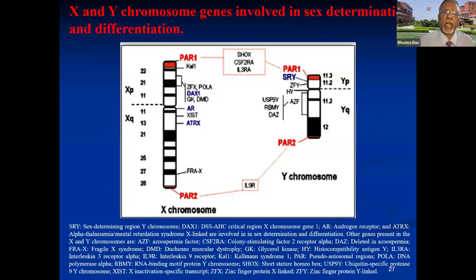They are located, and it's important in the Y chromosome: the SRY, the sex determining factor, the TDF genes, and the azoospermia region, also in the Q arm, AZF. So these are important things which can be easily done by banding, and you can see whether this is missing, absent, or translocated.